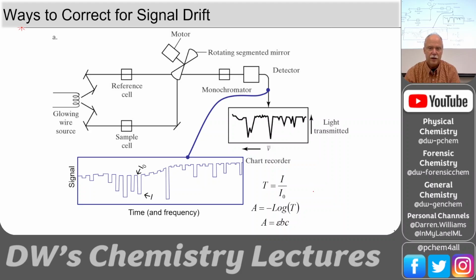So I made this thing. Okay, I put this in here. So this is more of what it looks like. Look at the drift. So this is the drift of the source. You see how it's drifting all over the place? Okay. So here the elevator starts, right? Elevator starts going up. And then here it reaches the floor, you know, and it has to stop. So the motor drains a little bit. And now the elevator is gone, is stopped.